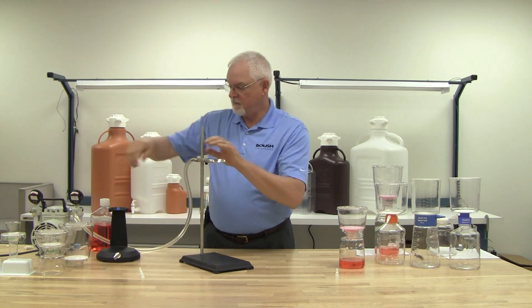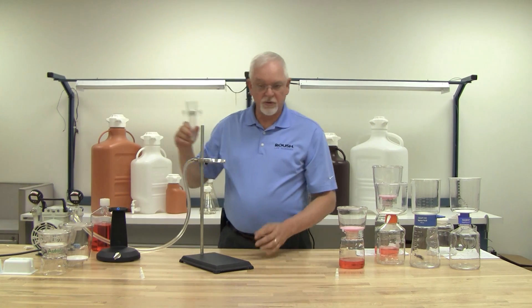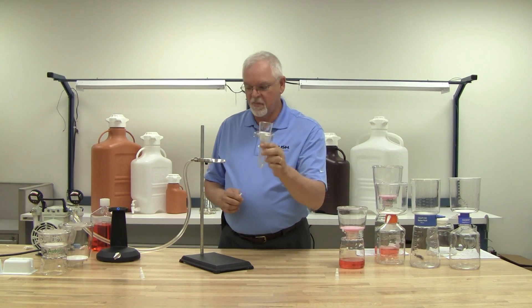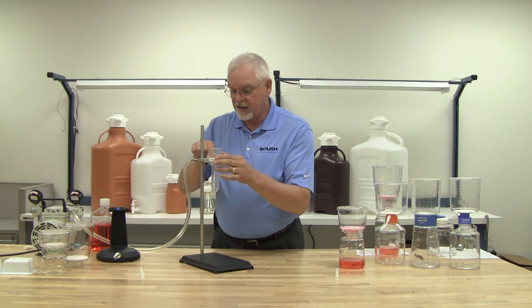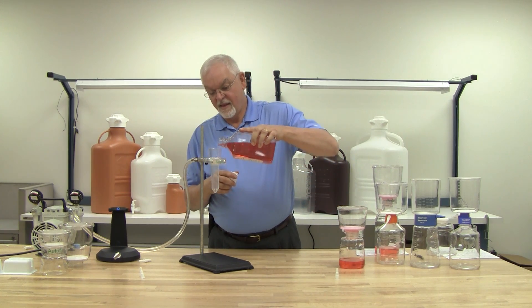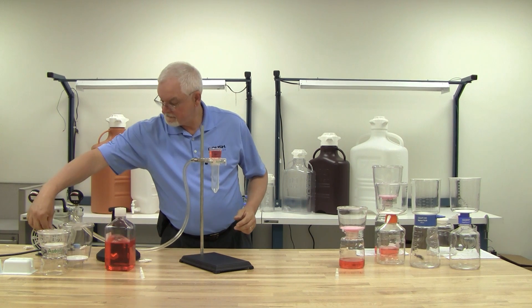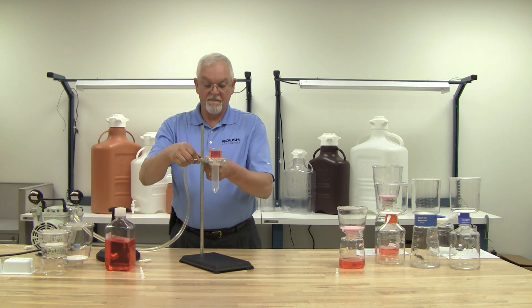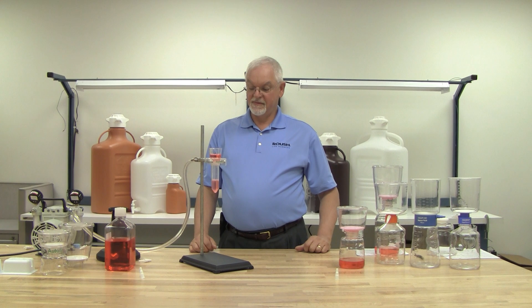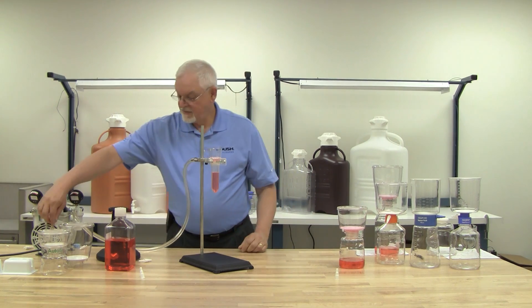In applications where you would typically be using a syringe and a syringe filter for smaller volumes of fluids, you can use our 50 milliliter centrifuge tube system. It does the same thing — it falls exactly into place. Let's turn on our pump. And off it goes. Complete.